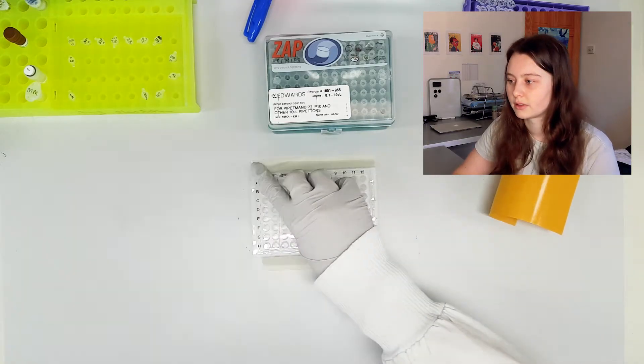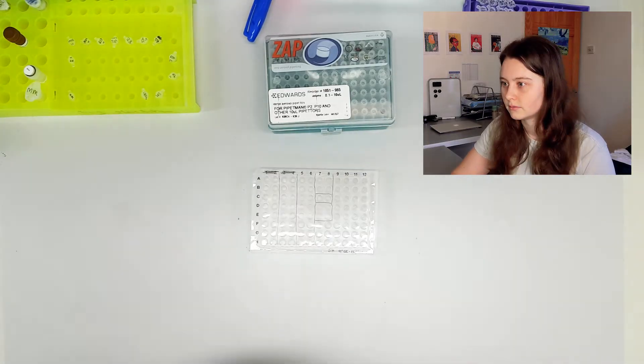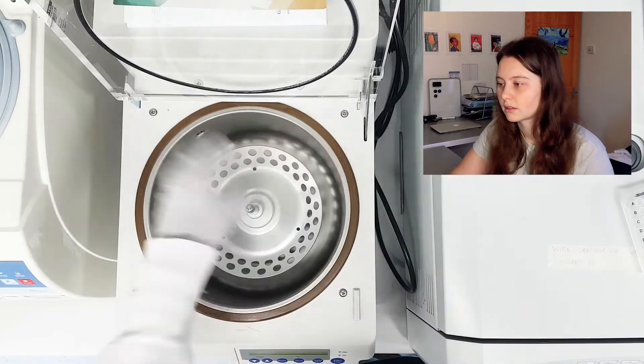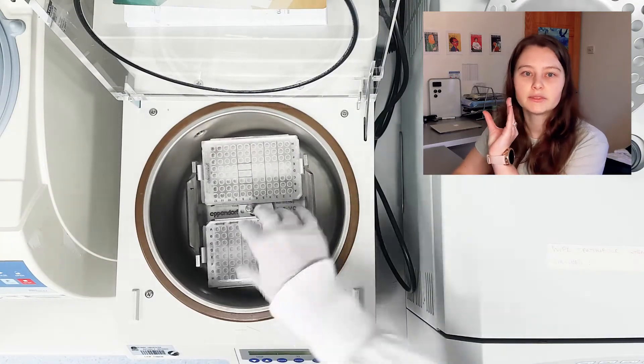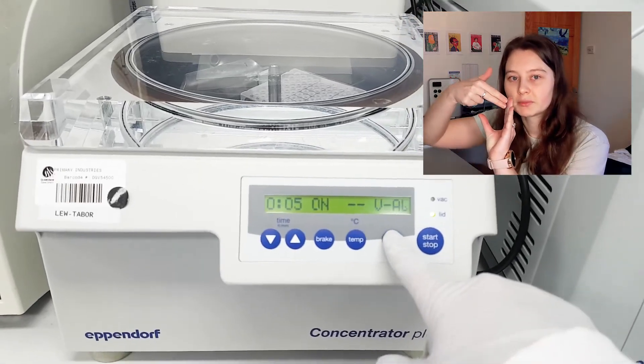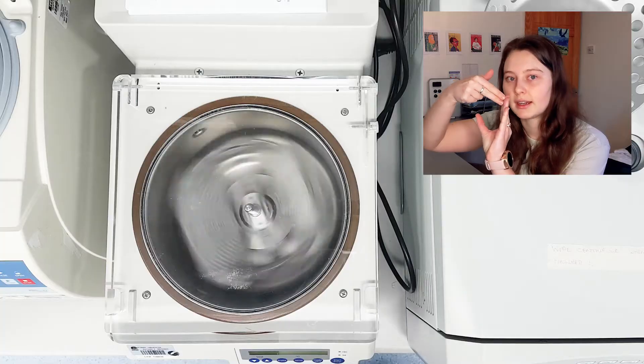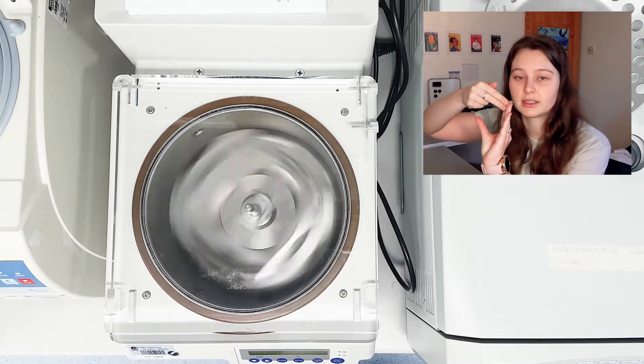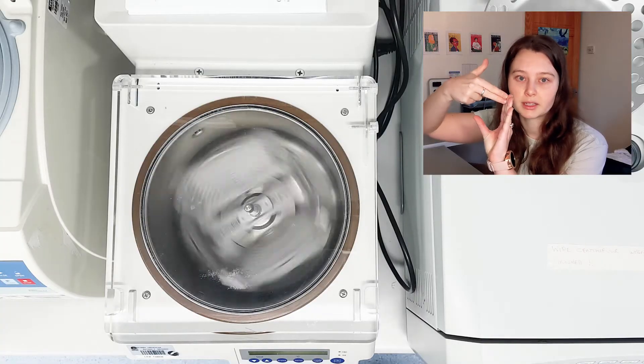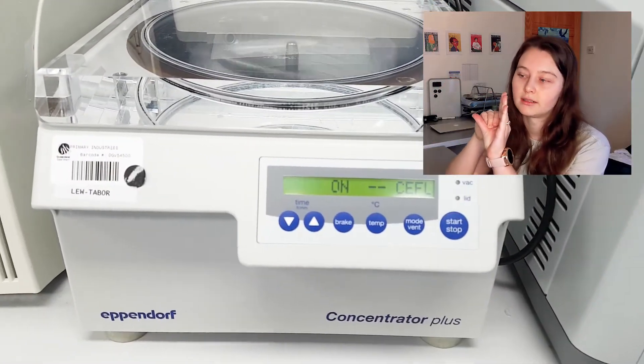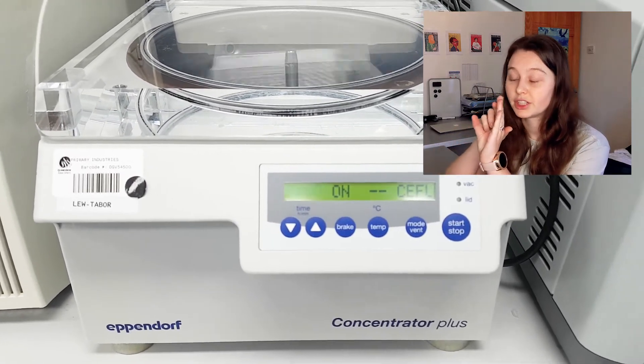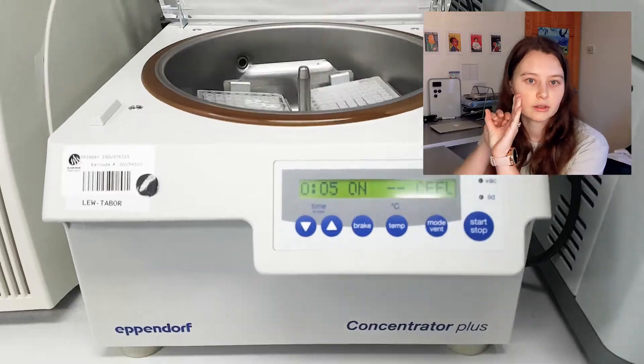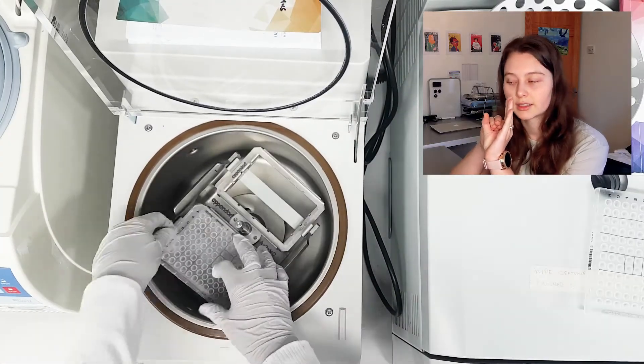So now we need to put our plate in the plate spinner. So if you looked at each individual well right now, because we've just been pipetting sample up onto the side, if we put this straight into the qPCR machine, the sample is going to be up here, the master mix is going to be down here, and you're not going to get a reaction because they're not sharing space. So you just give it a quick gentle spin so that it all sits at the bottom of the well and it's going to react together.